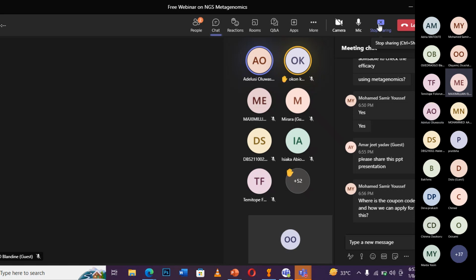Sorry, then. So what you say now is in metagenomics, I don't need to do culturing, then? No, you don't need to do culturing. That's why it's metagenomics, community DNA.